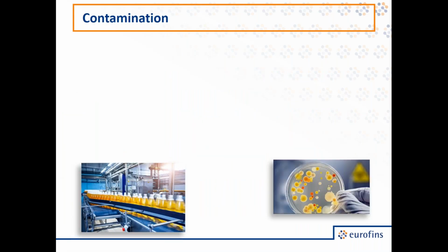And so contamination is another common source of off odors and off flavors. And this can also be broadly broken down into two classes: chemical and microbial contamination. So when you talk about chemical contamination, there's a wide variety of different sources. This can be contamination with potentially hazardous materials, cleaning agents, heavy metals, and the like, as well as non-hazardous but unwanted materials such as cross-contamination from another food product.